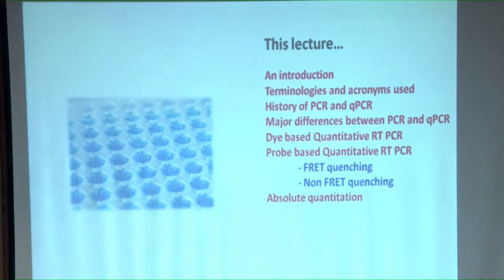So we'll be talking about absolute quantitation. And the biggest application of real-time PCR or qPCR in biology is what is called relative quantitation. People use this technology for gene expression studies, right? What do you mean by gene expression studies? When the plant is affected by a pest, what all changes are happening in that plant. So if you want to study the changes at the transcriptional level, what I mean is how the transcription and the protein formation is affected in the presence of the so-called insect pest.